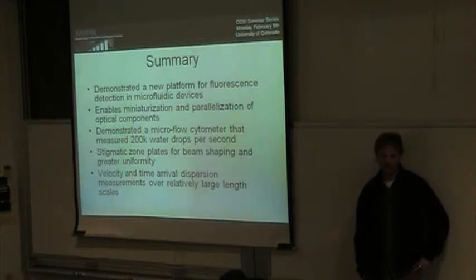And this is just done in SU8. It's not like a metal master. Does the SU8 wear out doing this? Like how many replicas could you make? I've never made more than 4 or 5 from the same master. Maybe you need to re-silanize it. I don't really know how it would work if you wanted to make 1,000, because I want to change the design after a couple times. But certainly several, I don't see any degradation.